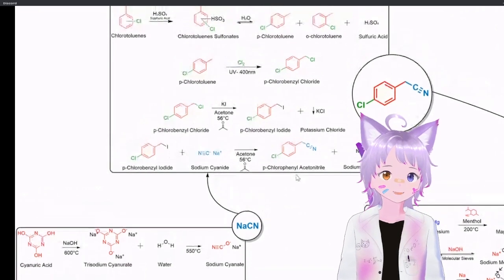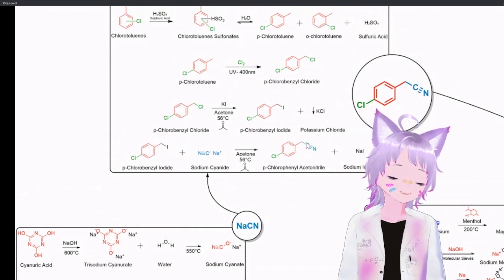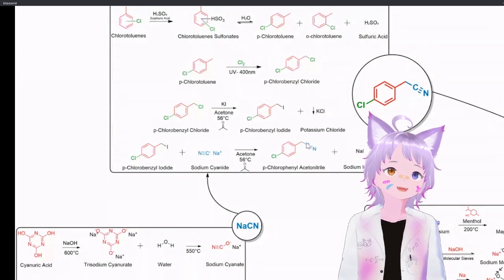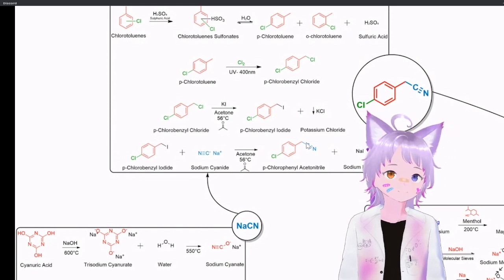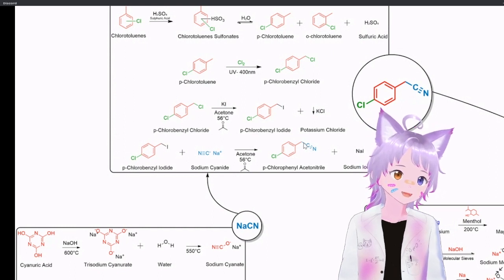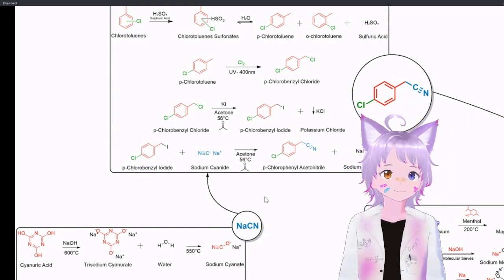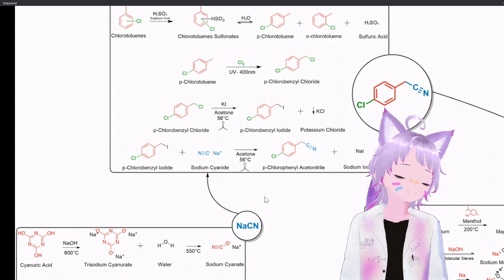Anyway, we continue. Honestly, this step isn't very crazy, but I can see at the sodium cyanide step how melamine could mess this up. Think about it, you're going to end up with something else. It would definitely mess this entire thing up and cause it to be this bulky bad reagent. This is why we have to separate out the decomposition products from the cyanate, but we already talked about that. Anyway, let's continue.